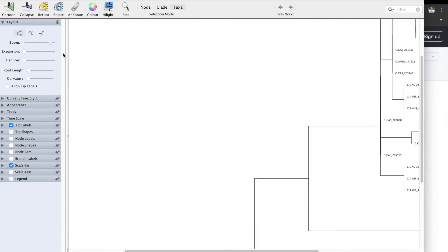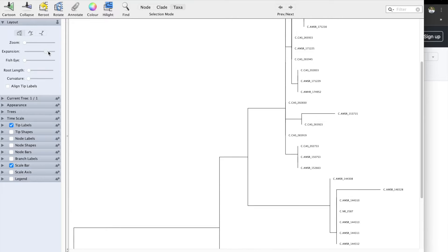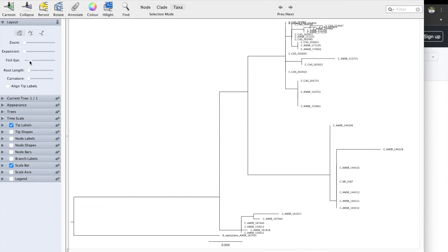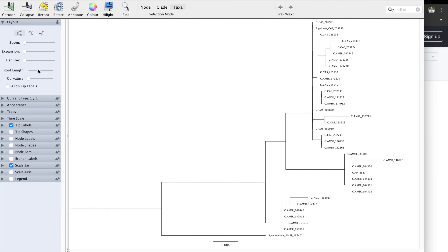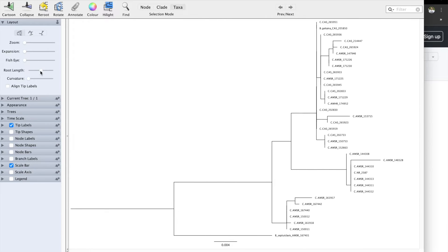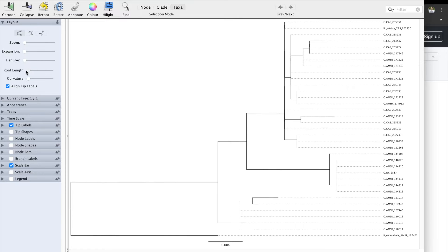Zoom is something you can use. Expansion we don't really use. Fish eye is not really common to see. Root length we use all the time. Curvature, not really. Align tip labels I use all the time — so when people look at my tree, they can actually see which one is which. Especially after coloring the backgrounds, it's going to be a lot easier to follow what's going on.